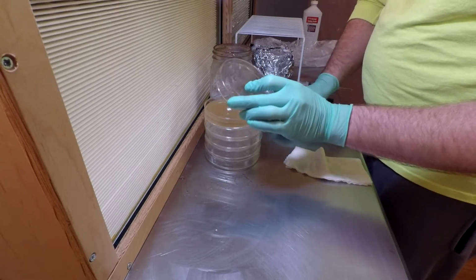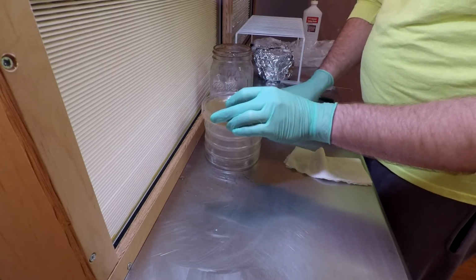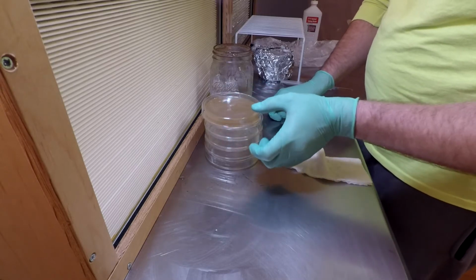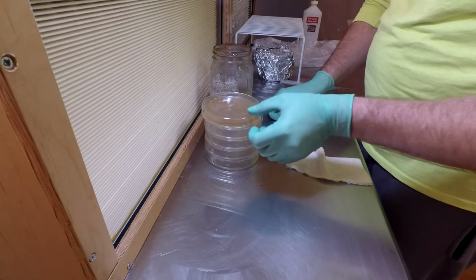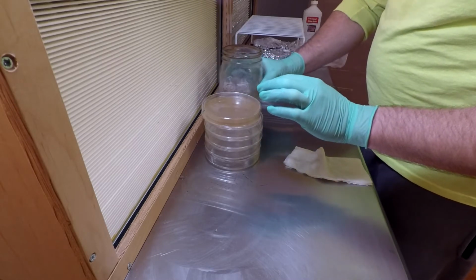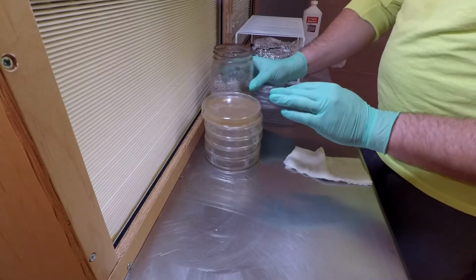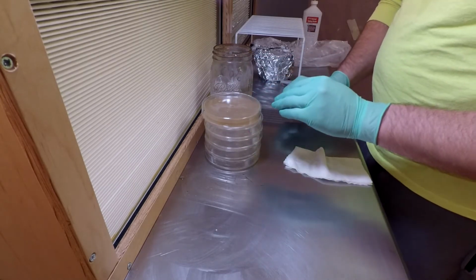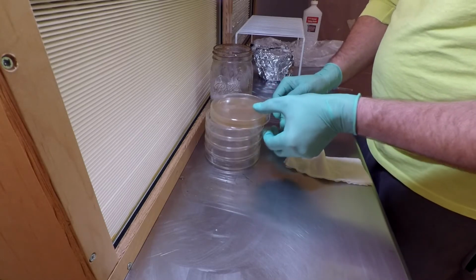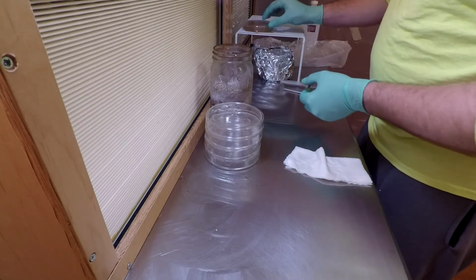So, just a tiny bit, still too warm. Okay, that didn't steam up. Well, it's slowly steaming up now, so it's still liquid enough I can play around with this. I'm gonna let it cool down for another 5 minutes, and then I think that'll be enough that when I pour this next dish, there won't be any steam on the top of the dish.